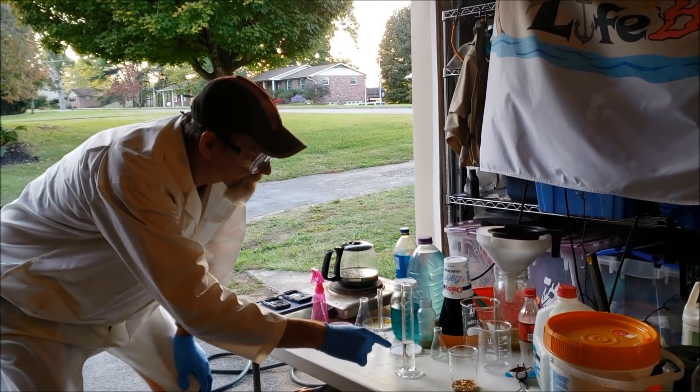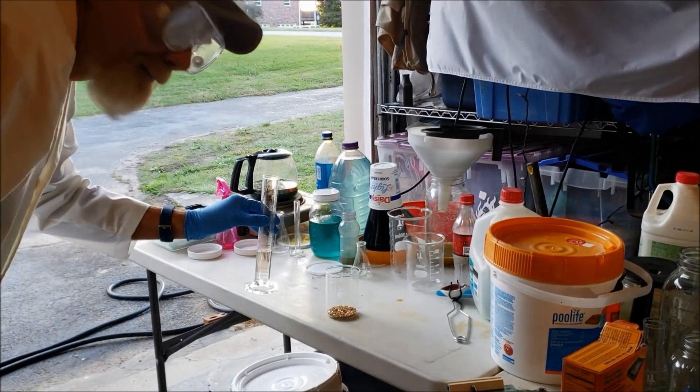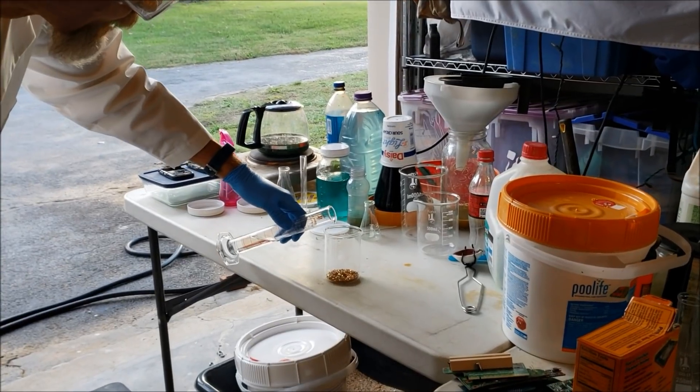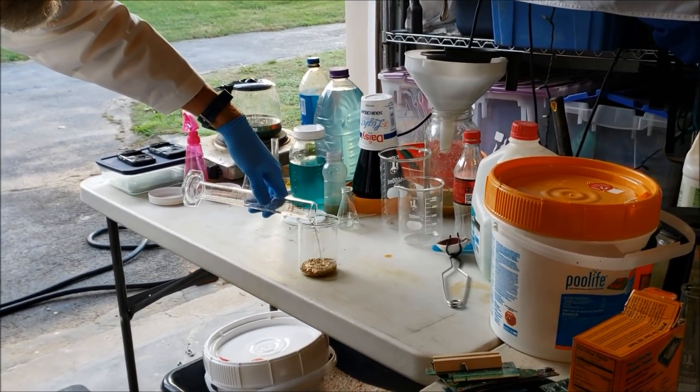And now we're going to mix the aqua regia in with the gold. The cool thing about aqua regia is it'll melt all the gold, turn the solution yellow, and then leave all the crap behind.